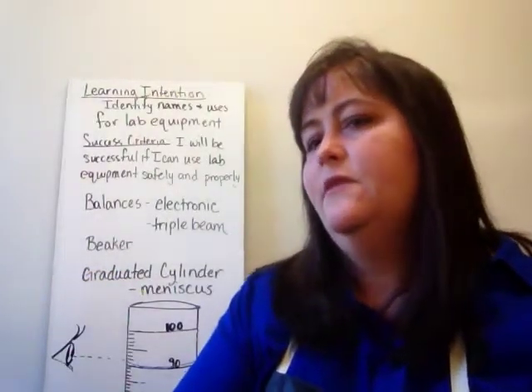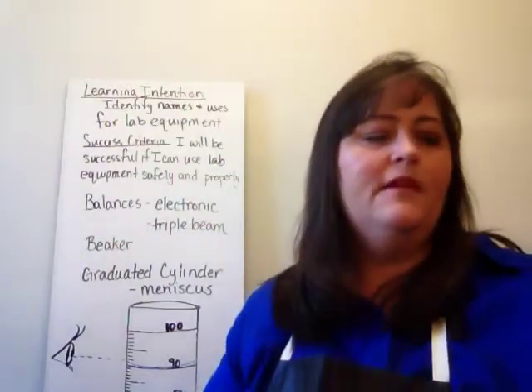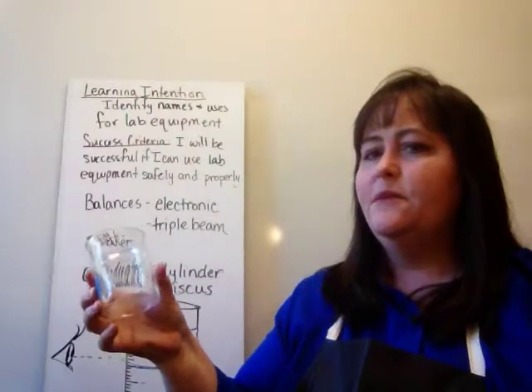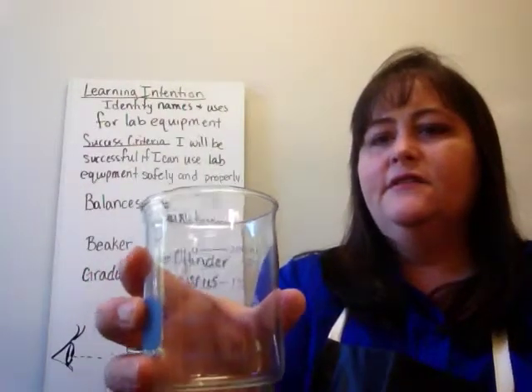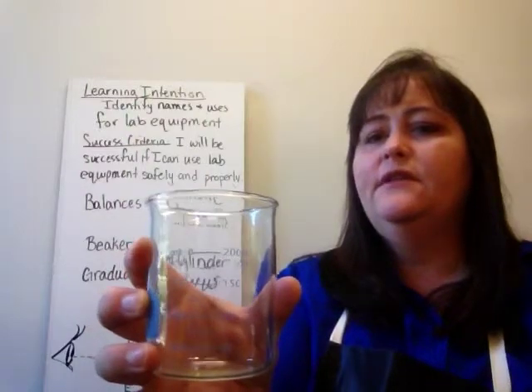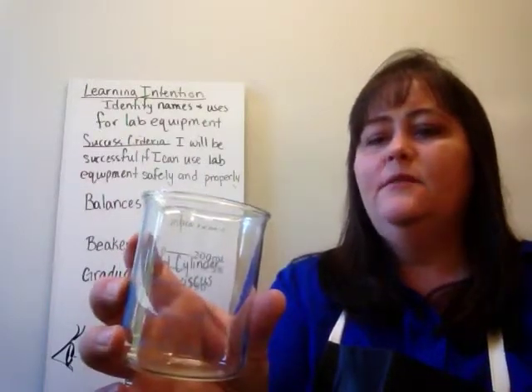This next piece of equipment we're going to use is the beaker. The beaker is a lot like a measuring cup. It's just like a measuring cup in many ways, and it has marks on the side that tell you how many milliliters of liquid you have in the beaker.